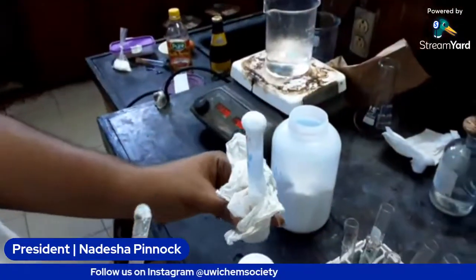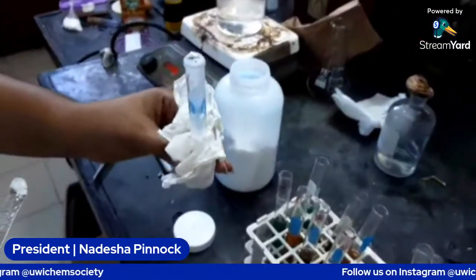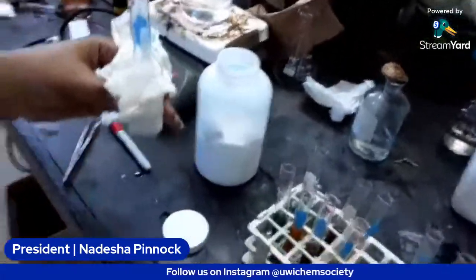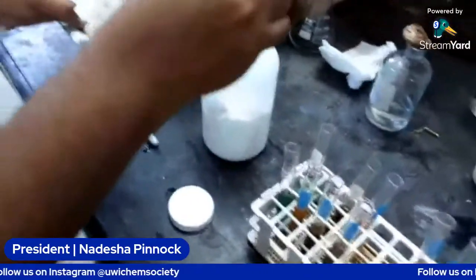Alright, so we're going to add a couple of spatulas. And I bet it's still acidic. I guess you can add it till it stops.